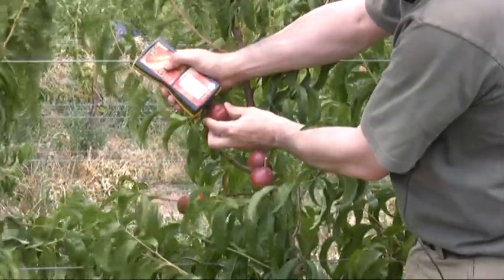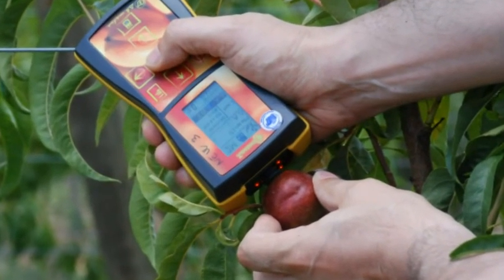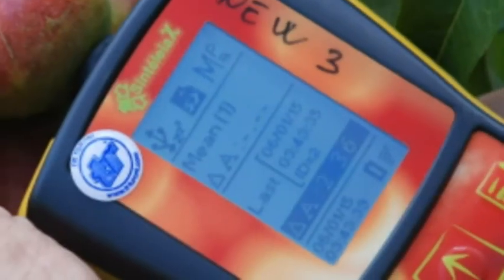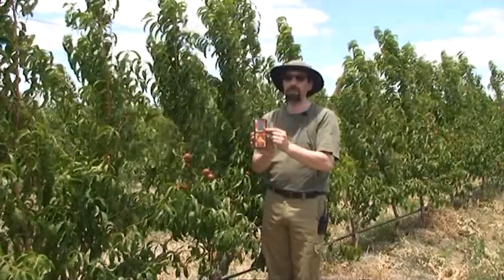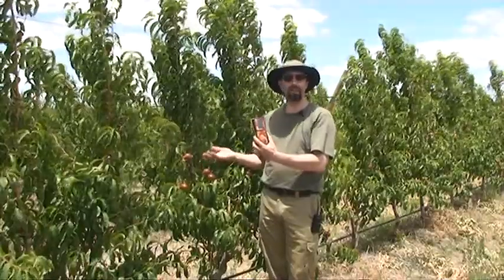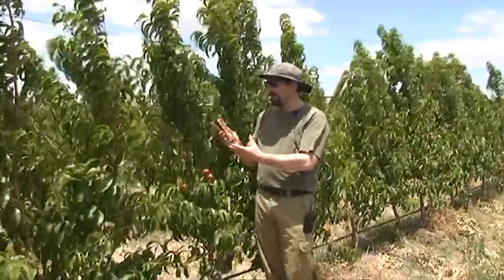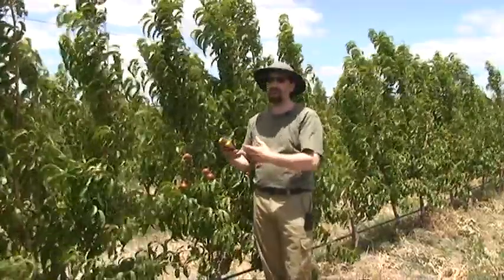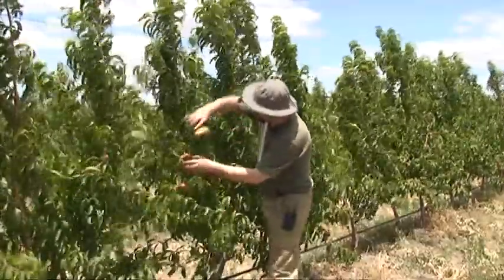In this way it tells us how mature the fruit is. We can read the value in the center part of the screen — in this case it is quite high, meaning the fruit is highly immature. By monitoring the fruit and the ripening directly on the tree, it allows the grower to understand when is the correct moment to harvest the fruit according to its correct development.